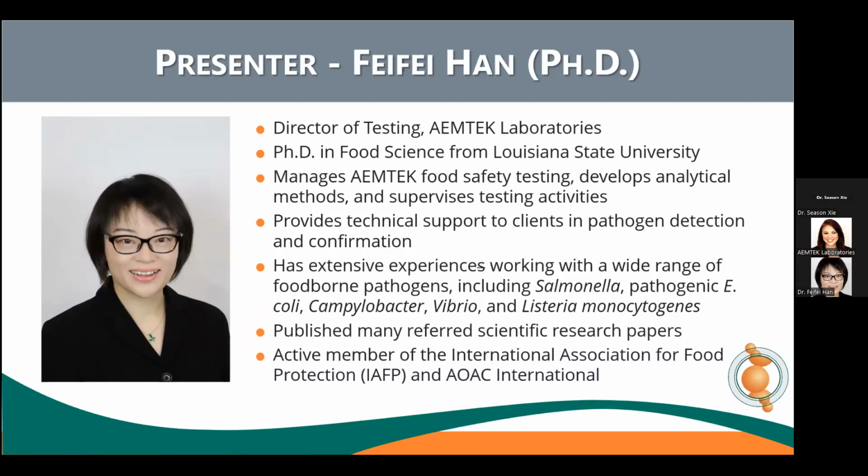In the next 30 minutes or so, we will explore the current methods for detecting Shiga toxin-producing E. coli, or STEC, and introduce a game-changing technology called droplet digital polymerase chain reaction, ddPCR for short. We will discuss the workflow of ddPCR for STEC confirmation, result interpretation, and present case studies to show its applications.